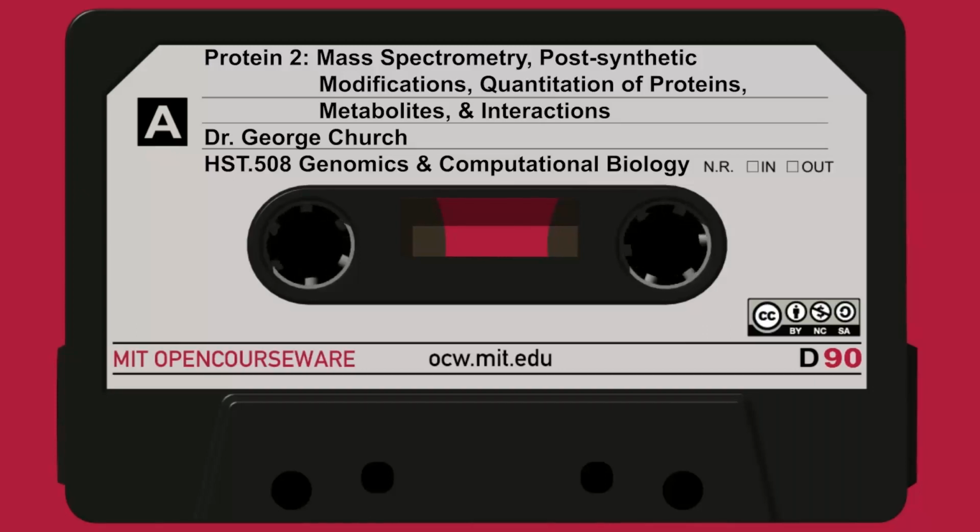The most interesting in this particular study, the authors highlighted, was YMR116P, which, remember, this is a very mature field. This is a very recent study, and ribosomes were very well characterized, and I think we had the conceit that at least in microbial systems such as E. coli and yeast, we really understood all the proteins that were required to make a ribosome hum. But here was a new ribosomal protein, which has since been confirmed that this is a bona fide part of the 40S subunit. You can see here it had many peptide hits, so it was equal in abundance to the other 40S subunit proteins.